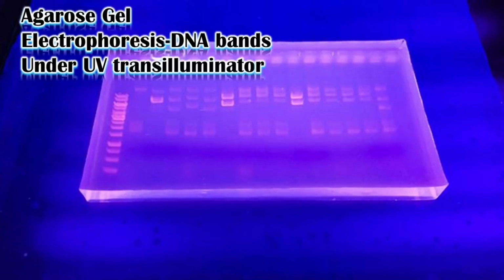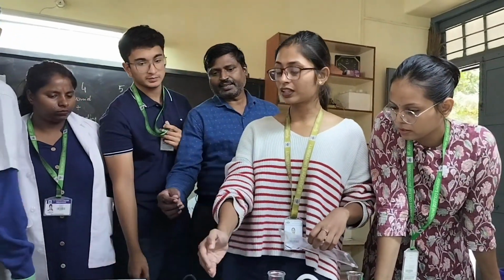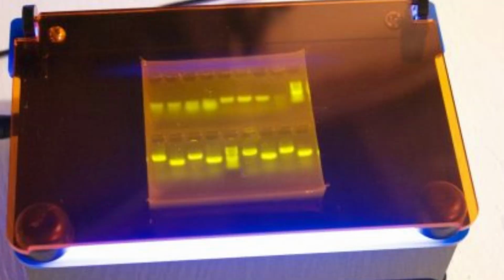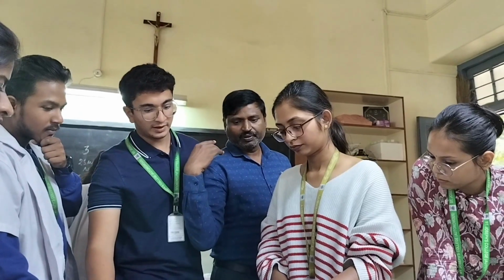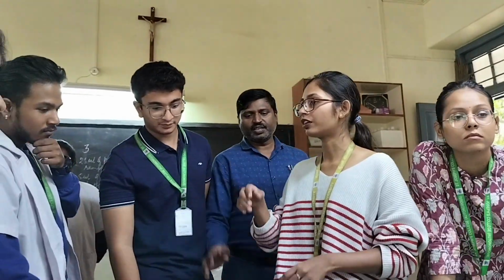It's almost 1/4 of the gel. This will take about 1 hour's time, and after electrophoresis, DNA samples can be visualized under UV light. They appear fluorescent. The smaller fragments would have traveled the longer distance, and the larger fragments would have traveled the lesser distance. By this technique, we can separate DNA fragments based on their sizes.